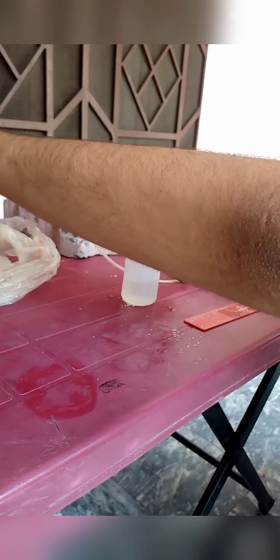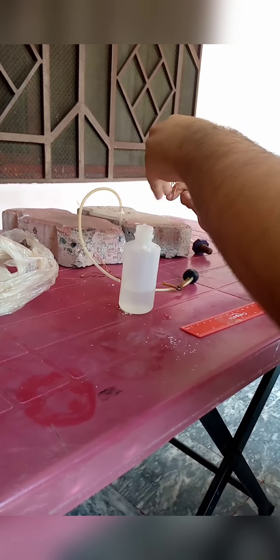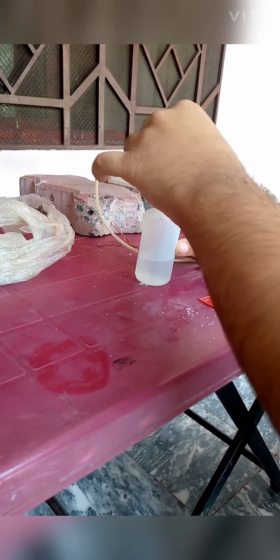Now use copper wire. Copper is a catalyst. If you have no copper, you can use another type of low quality copper wire. I am using copper wire. Also remove the insulation, otherwise it will not work. Let me remove this wire and bend it a little bit.